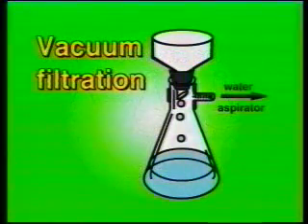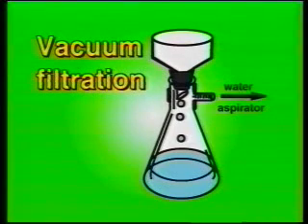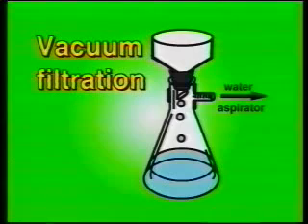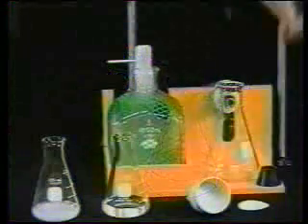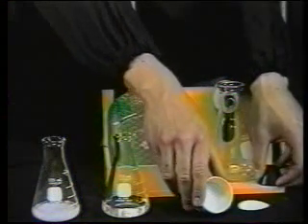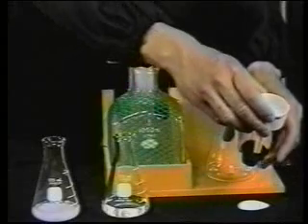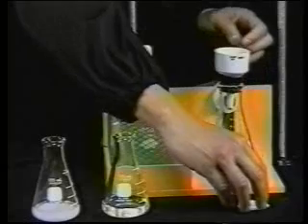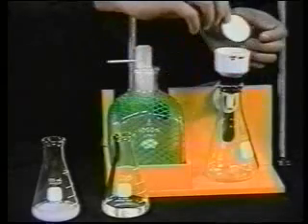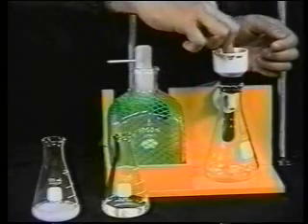Now that the crystals have formed, they need to be collected and dried in order to determine the yield from the crystallization and to analyze the purity. The separation of crystals from the supernatant liquid is best achieved by vacuum filtration, which has the added advantage of drying the crystals. Vacuum is applied to the filter flask through a water trap. Place the Buchner funnel on the filter vac adapter in the neck of the filter flask and then add filter paper.